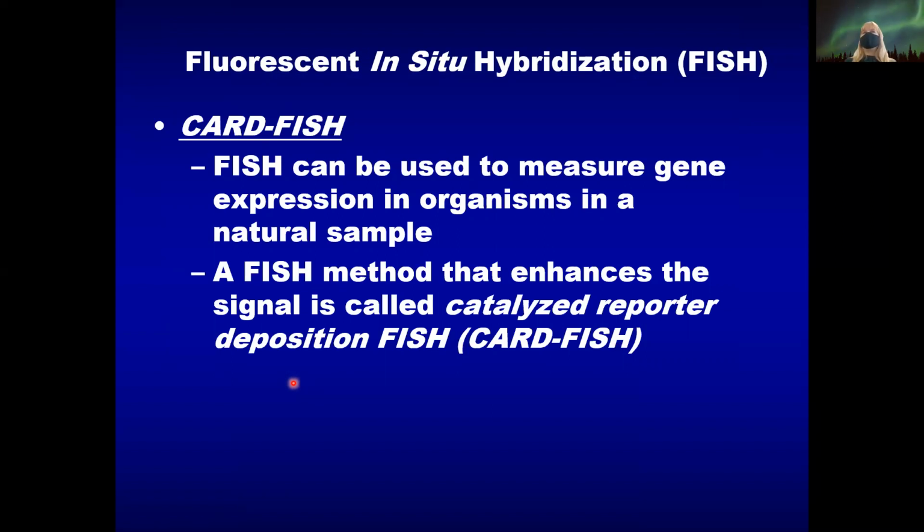So just saying, yes, I see that there are Streptomyces bacteria in this ag field that are, I'm hoping, doing biocontrol by turning on their antibiotics. A lot of the Streptomyces I work with, we think that they're using antibiotics to kill off plant pathogens. But just because they're in the environment doesn't mean they're necessarily doing that. And so this CARDFISH technique would be a way to look at gene expression in these microbes.